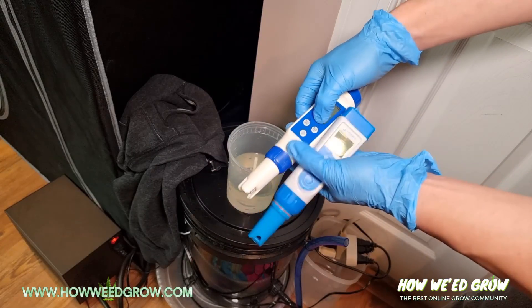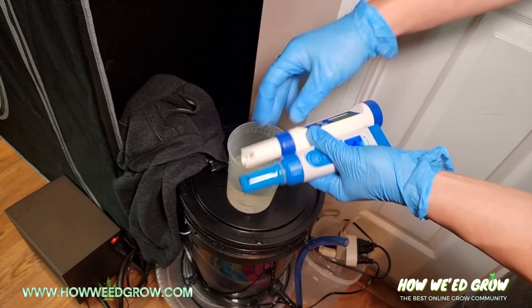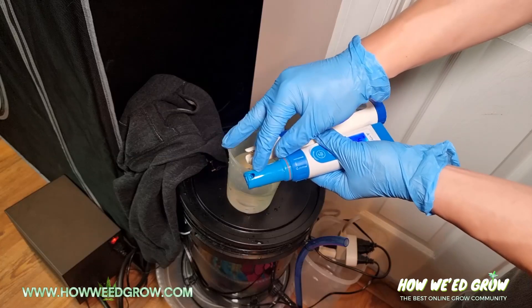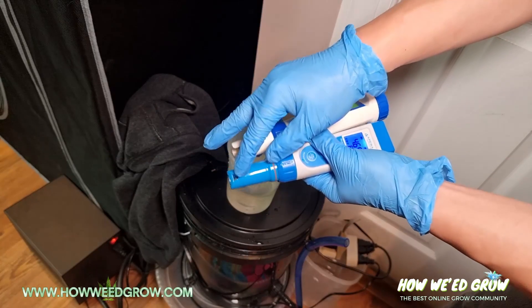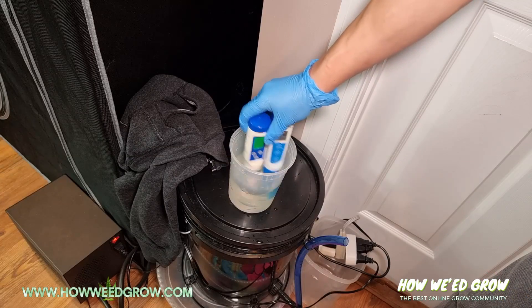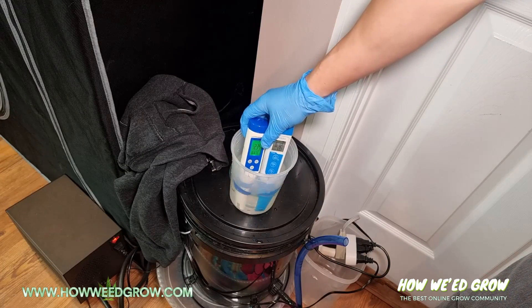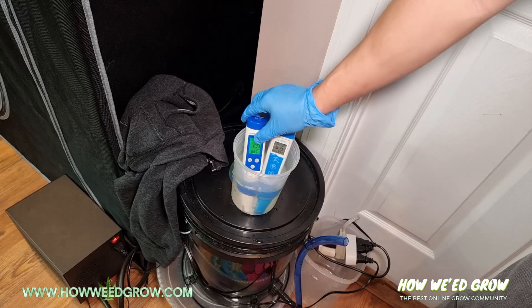When you're taking a reading, it's important that you swirl it, because at times bubbles will accumulate on the probe and that'll throw off the reading. Make sure no bubbles have accumulated — you can see the bubbles came up and now there are none. Then let it sit.